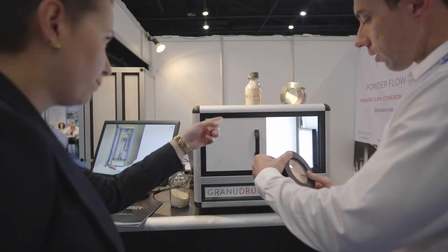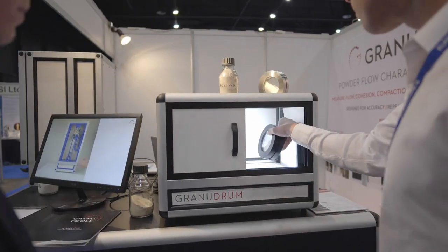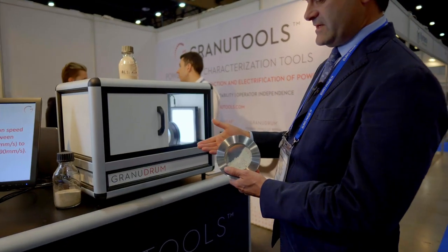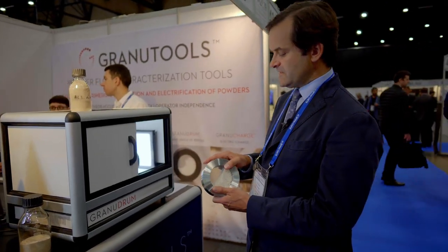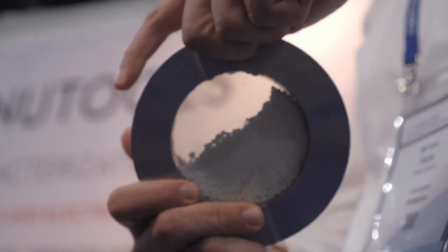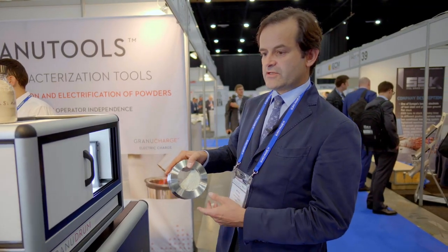To this end we have developed the Granudrum. The Granudrum is a system which measures low-consolidated material at high speeds, which is exactly what is happening in the additive manufacturing printer. The powder is confined in the cell, the cell is rotating, and one can look at the fluctuations of the powder bed.